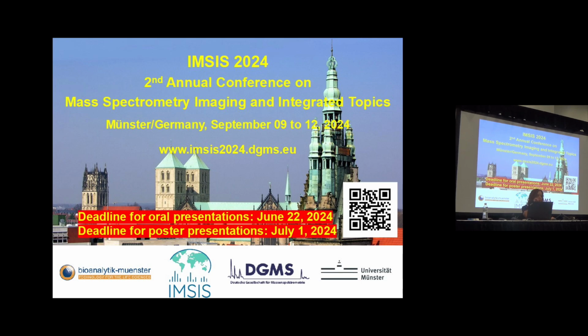So yeah, if you stained that section afterwards, and you can see it in that picture I showed where we did the limit of detection, you can definitely see some marks. Even with an irregular pulsed laser where you can be a lot more judicious with your laser power, when you do that many analyses, especially on frozen tissue, you do see some damage. I see a lot less damage on fixed tissue.